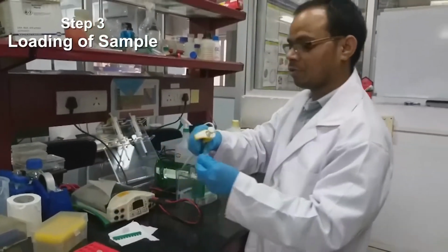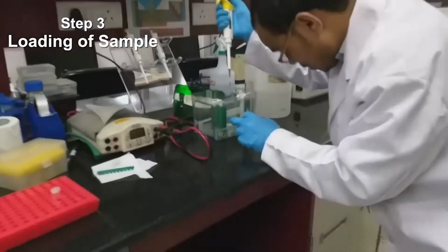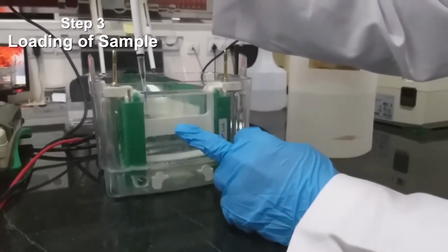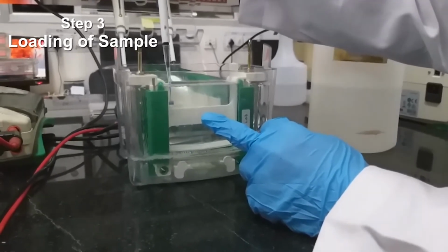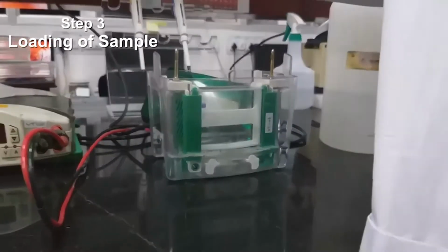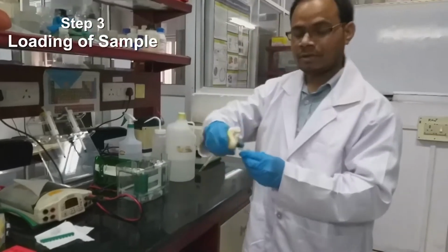Then first I am going to load the marker or protein ladder. Next I will load the sample.